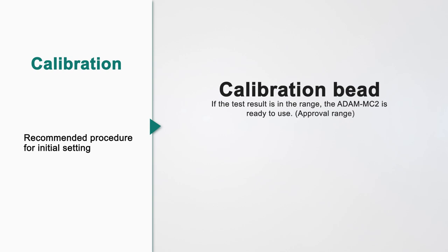Second, calibration. If the bead test result is in the range, the Adam MC2 is ready to use.